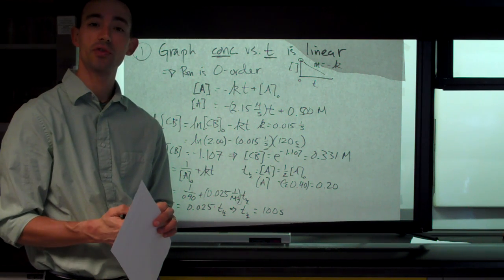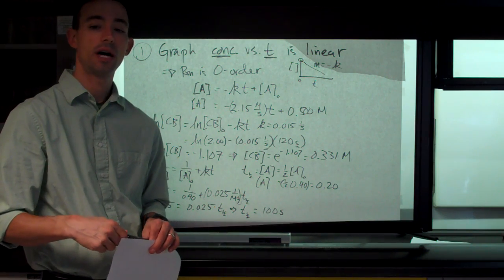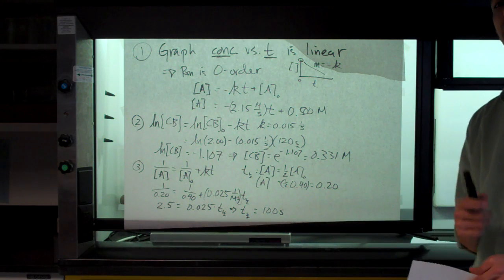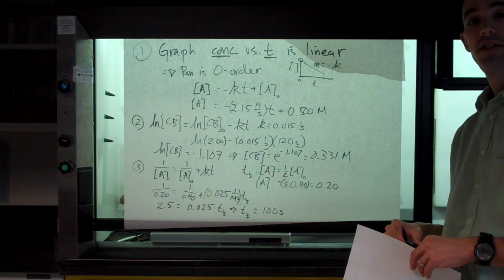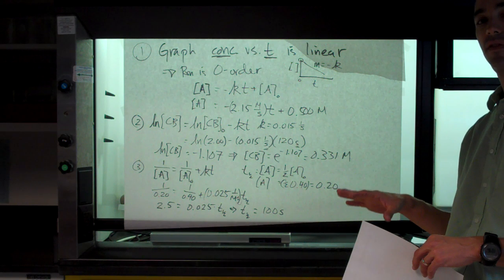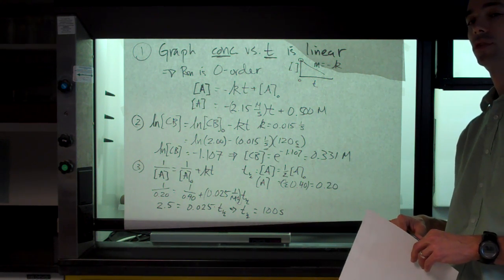The procedure is pretty straightforward, and you should have a pretty successful opportunity to determine the rate law of your crystal violet. Again, after you've completed the lab, be sure to have your data ready, and you can watch the data analysis video that will describe how to take your raw data for absorbance and time and turn that into the rate law of your crystal violet reaction.